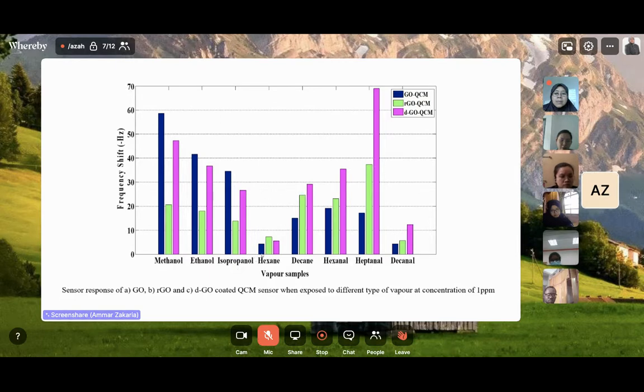But again, if you have this pattern, low, high, and low, of course, you can clearly see that this is hexane, right? Because the trend is different from this trend, right? Because low, right? Whereas if you take a look at it, they have the same pattern, right?